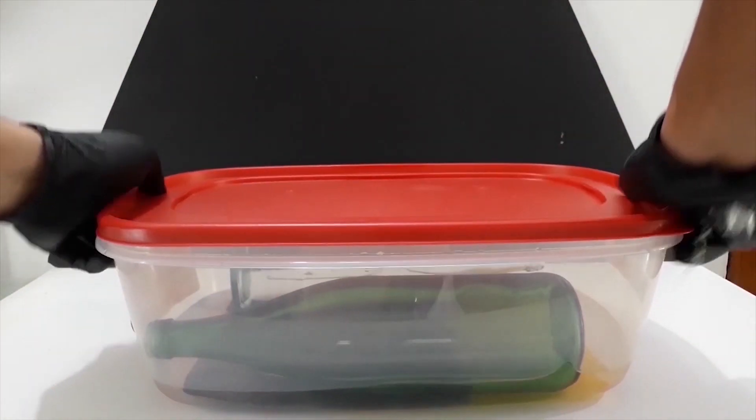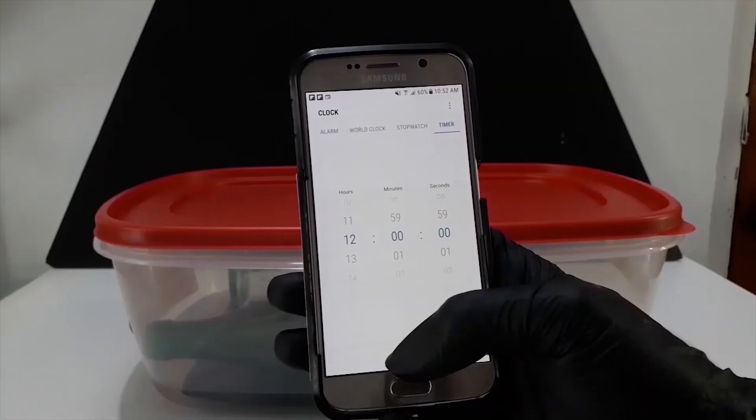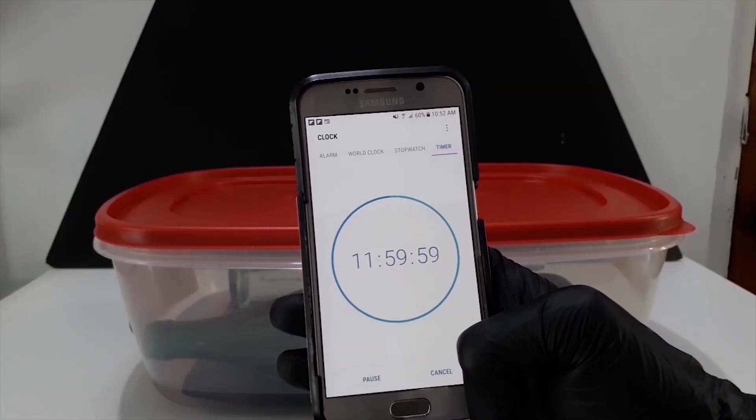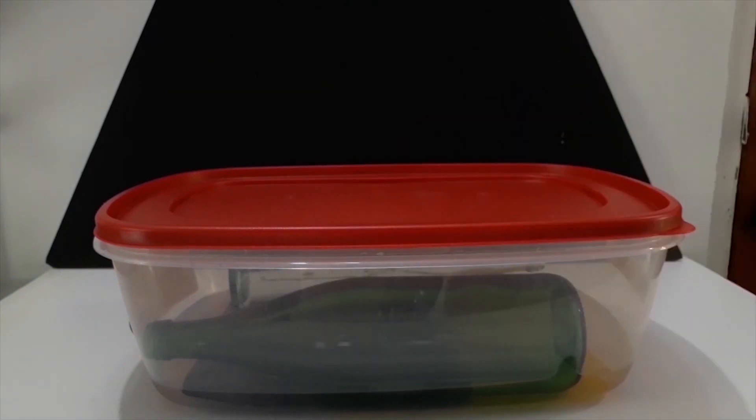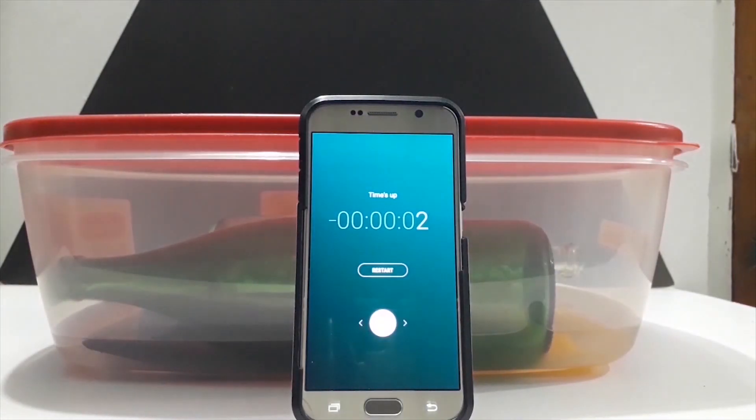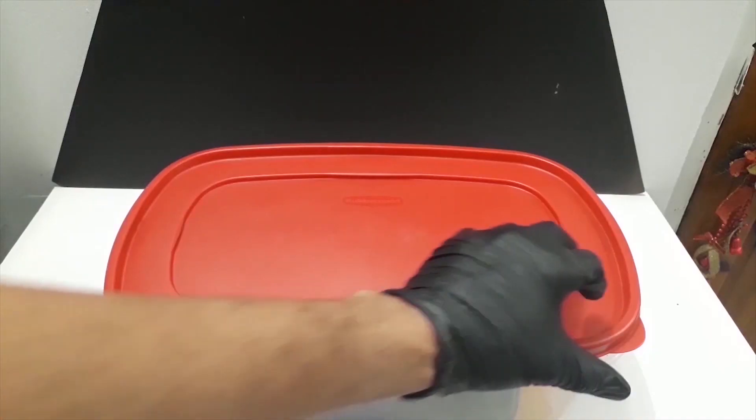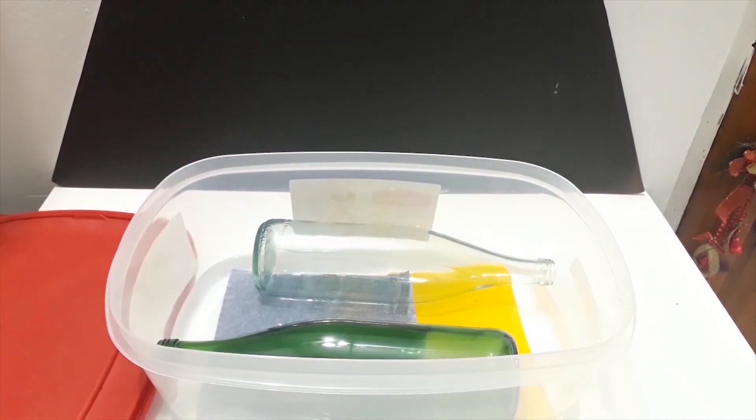A lid was then placed on the container and it is left to sit for 12 hours. After 12 hours, the dechlorinated PVC resin cloth was removed from the solution and rinsed with fresh water.